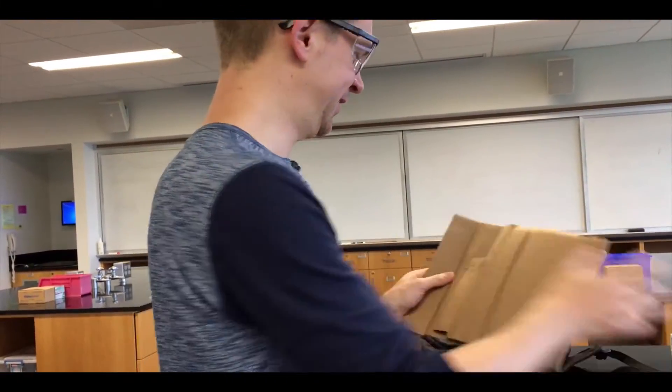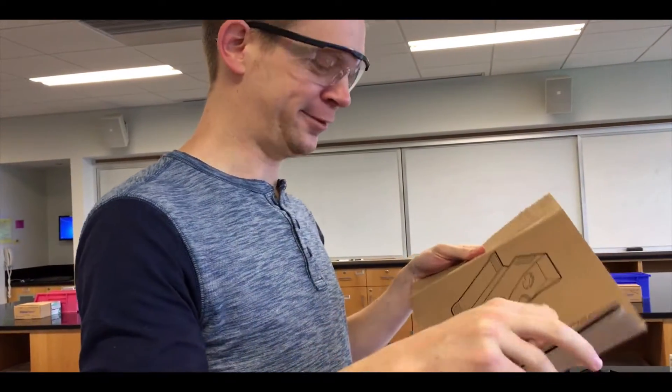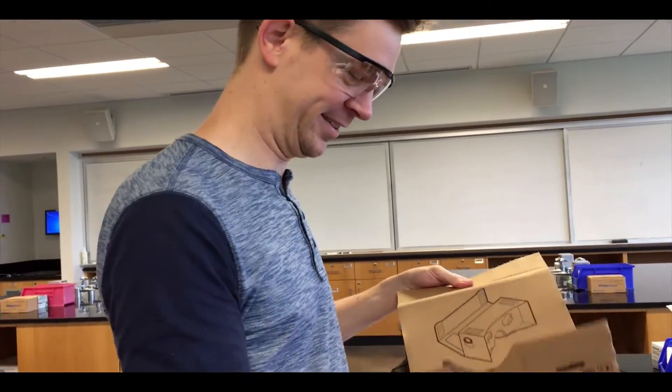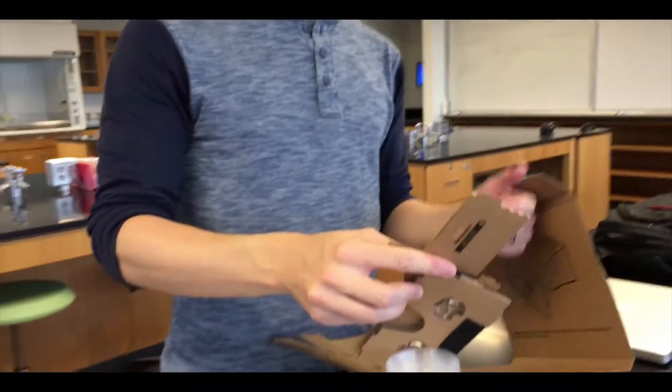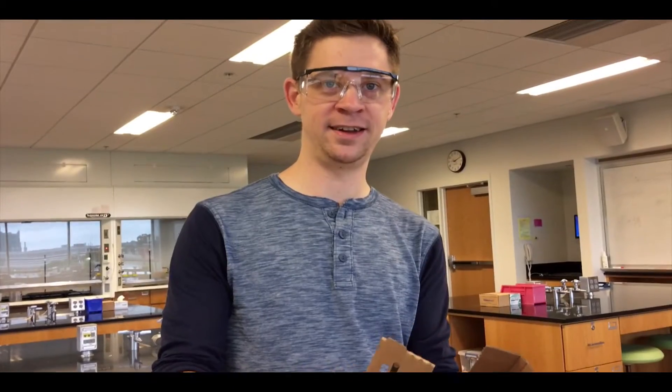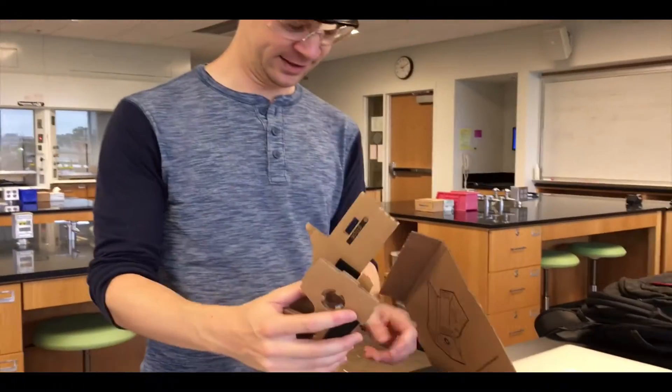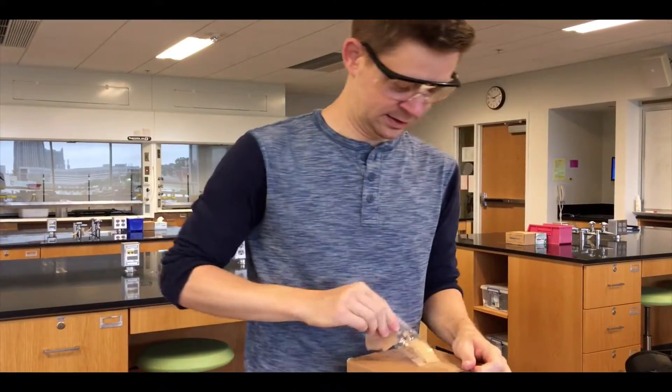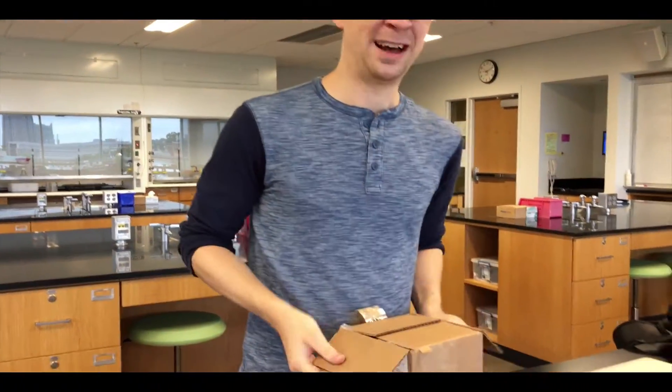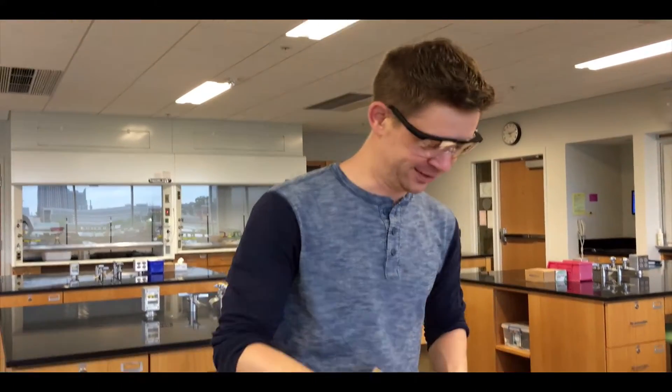Could this be a CD? These things don't come with CDs anymore, right? Oh, I know what that is, I've seen those before. Oh, is this one of those stereographic like 3D thingies, like a virtual reality thing, like a Google Cardboard thing? Yeah, let's see. When you have a baby, you perfect your box opening technique. I know, that was fast. Five boxes a day.